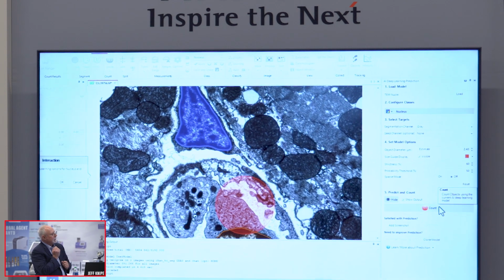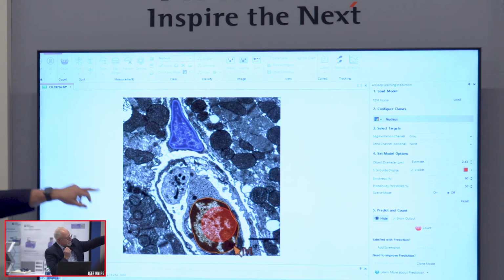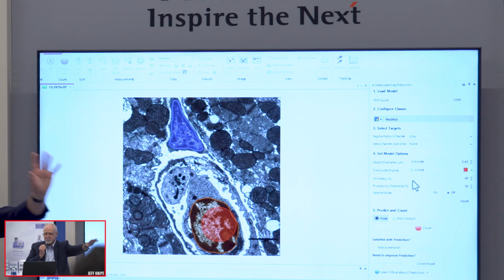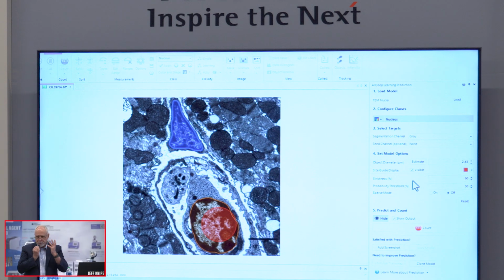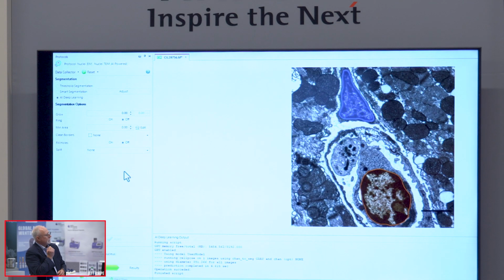Once we confirm that, we can test out the segmentation before we continue. So you can see how I found it. There are adjustments here I'll point out in another protocol where you can dial this in for your own samples. And simply, again, going through in the interactive mode, it will complete the measurement.